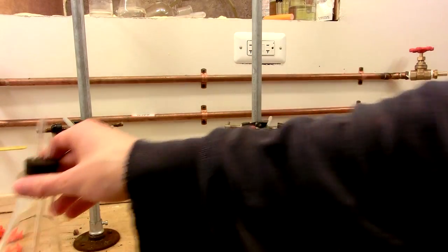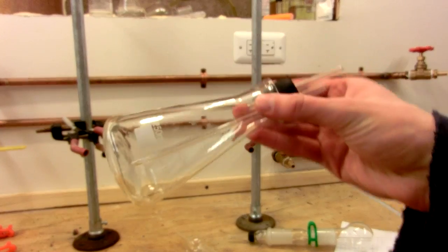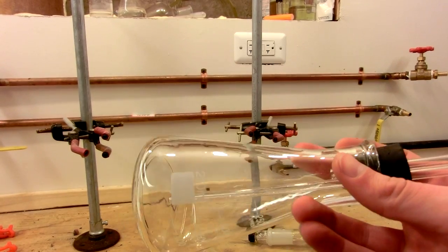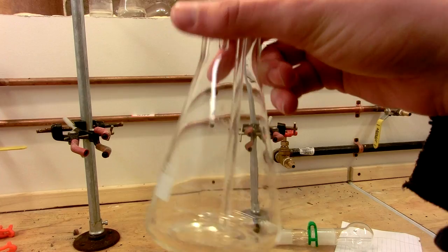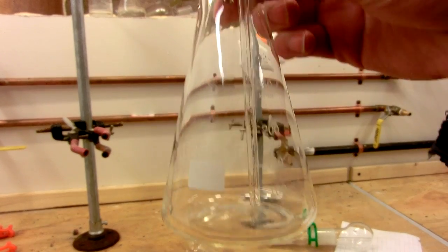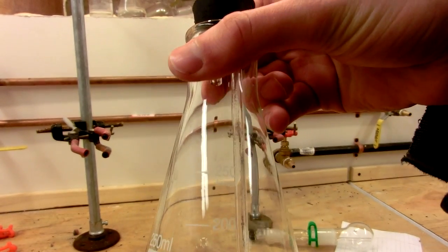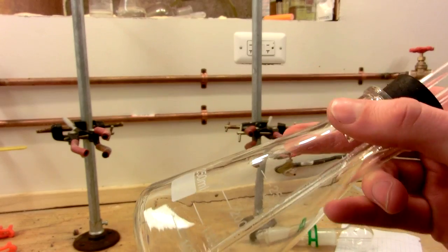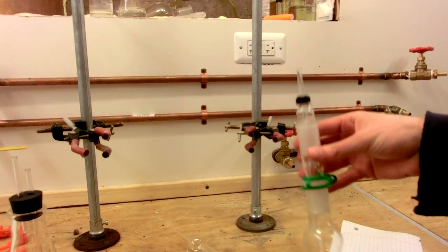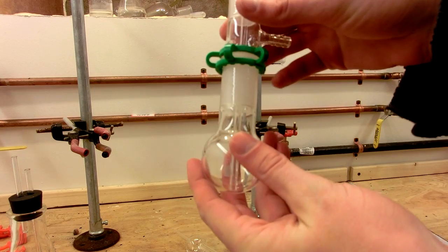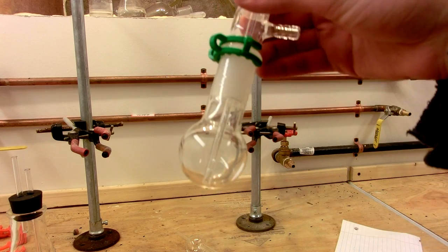The same is true for this apparatus here. If I was drying with sulfuric acid, for instance, a larger volume of chlorine gas, I might use something like this, where I could put a significant amount of sulfuric acid, up to 250 milliliters, in this flask, to dry it, or I could use this apparatus still, but just replace the round bottom flask on the bottom with one of a larger size.